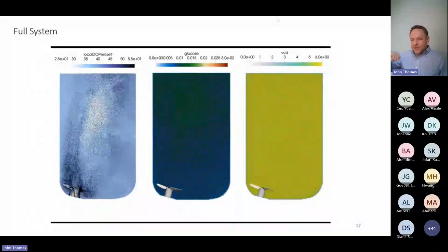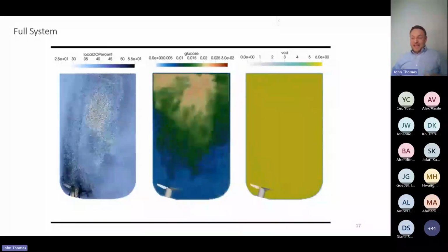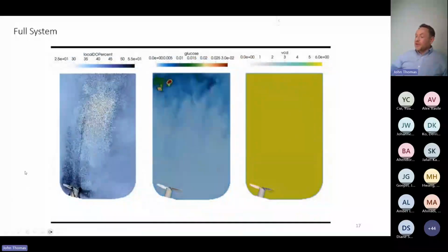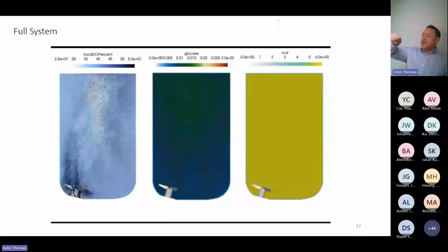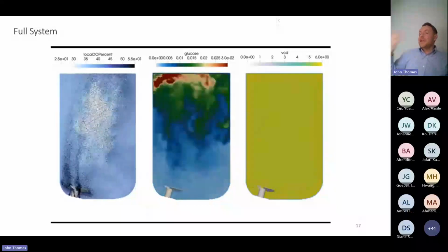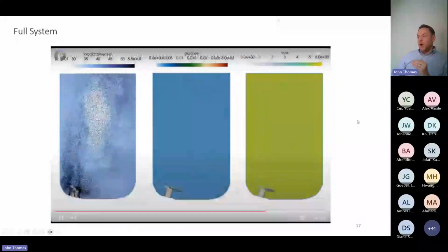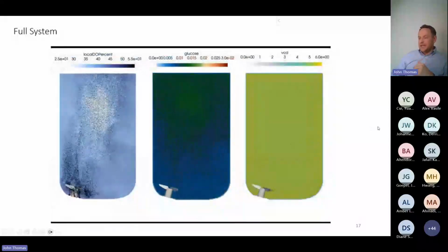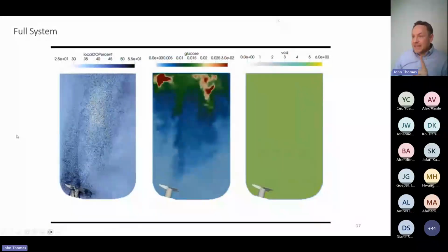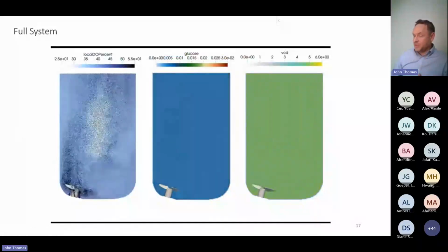Said again, as VCD goes up and those cells gobble more and more oxygen, the controller kicks on. So the probe is always reaching its 40%, but in order to get that, the controller logic had to go back and increase the gas flow rate in a manner that increased kLa to make the OTR match the OUR at the set value of 40%. And note, here it comes again. We see standing gradients in the DO concentration, just like we saw in the BMS paper, just as they measured.